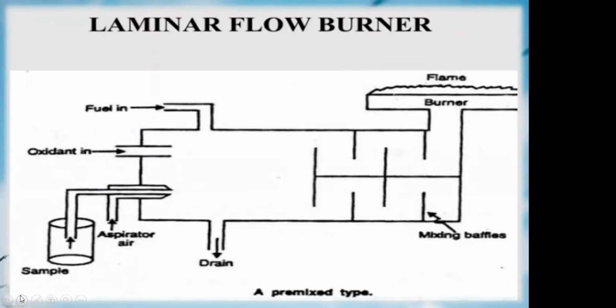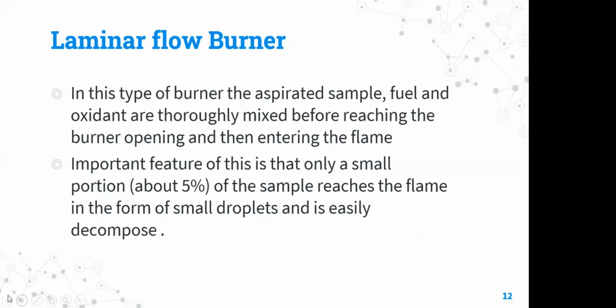The third one is the laminar flow burner. You can see the diagram. It is also called a pre-mix burner. This is called pre-mix because in this burner, the fuel and oxidants are pre-mixed before going to the tip of the burner, so they are thoroughly mixed. And from here, my team member Kashif Hussain will continue to describe.